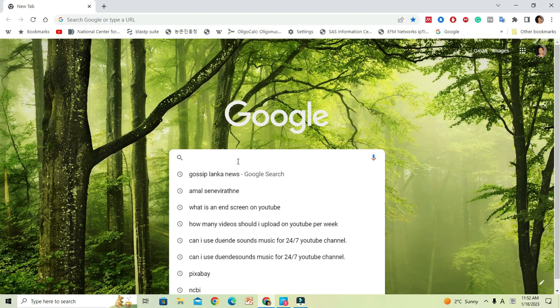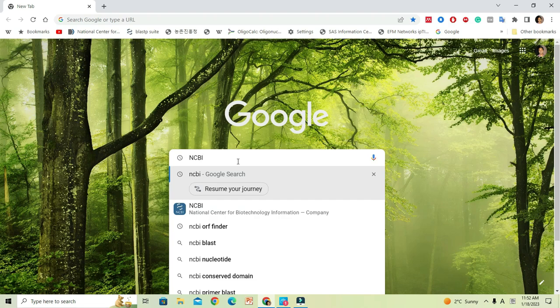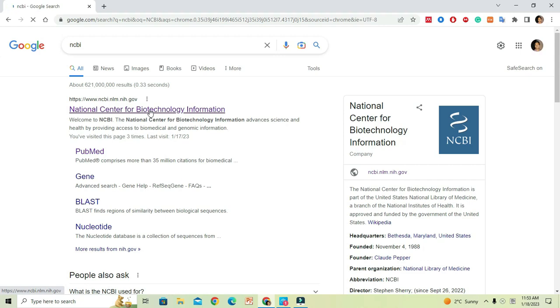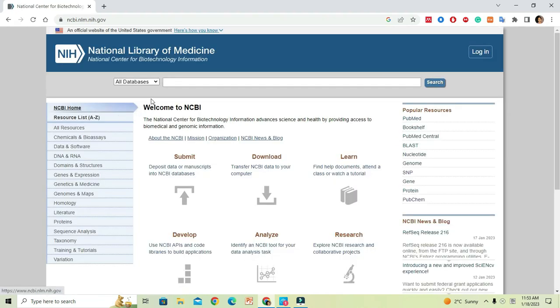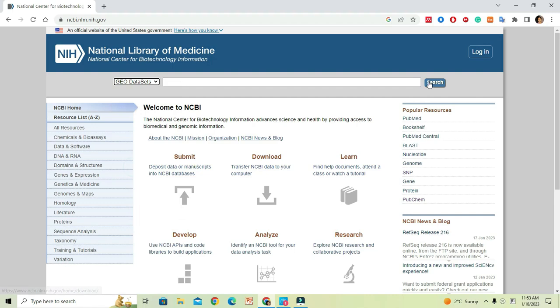For that, first you have to move to NCBI's official web page. Search NCBI on the browser. Once the web page is opened, you can check the drop-down menu located at the top left corner named 'All Databases'. Click on it, scroll down, and here you will see the link to GEO dataset.